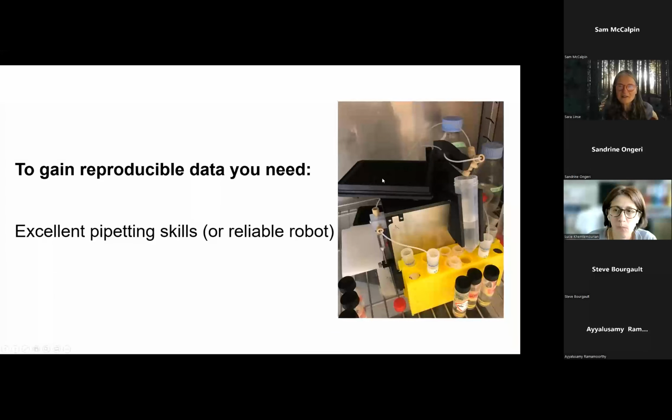So in my lab, we actually have a person, Tom Lading, who built this robot for us. So here's the plate. And it has some tubings, and you put your buffer and peptide in different tubes, and you just tell the computer what will be my dilution series, if it should be linear or logarithmic, and how many wells of each. So how many replicas of each solution.